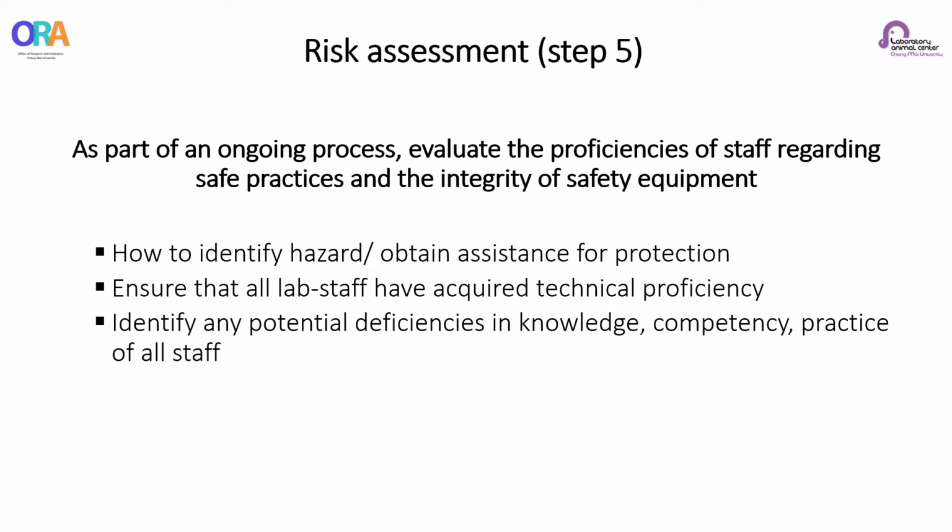The principal investigator should ensure that the laboratory worker has acquired the technical proficiency in the use of microbiological practice and safety equipment required for safe handling of the agent, and has developed good habits that sustain excellence in the performance of those practices.